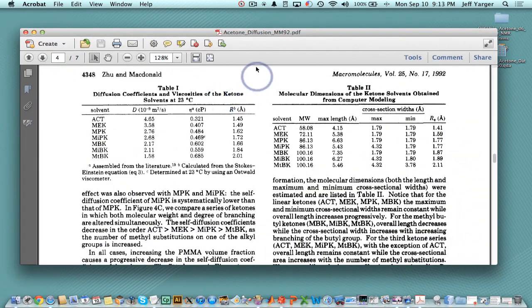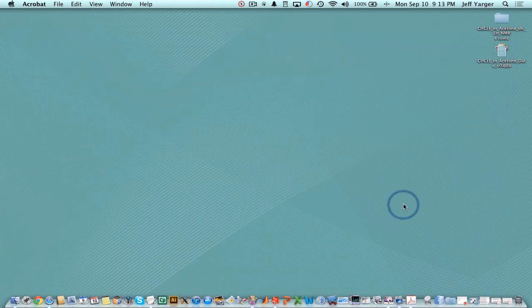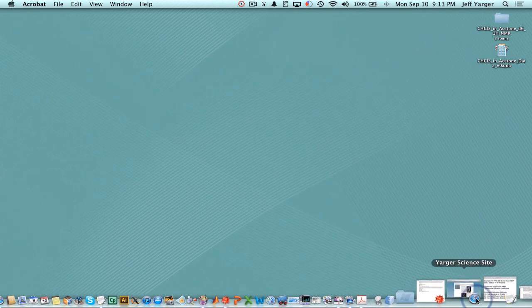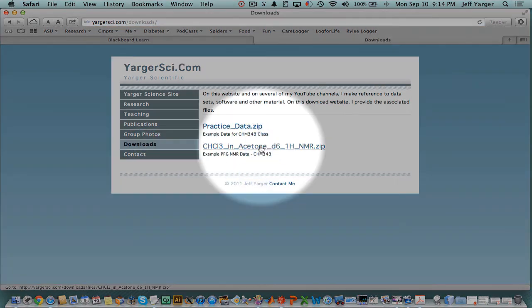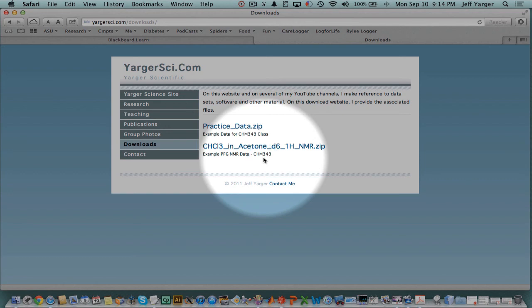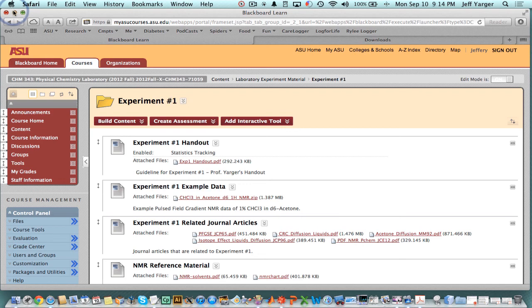A paper that gives the diffusion coefficient of acetone is a Macromolecules paper from 1992, which gives the acetone diffusion coefficient as 4.65 times 10 to the minus 9 meters squared per second — that's what we're going to use as our internal standard to calibrate. We're neglecting the isotope effect, which for this molecule is very small. You can get the data off yargorsci.com under Downloads. If you're in ASU Chemistry 343 PChem Lab, you can also go to the Blackboard site to get that data as well as several other papers and references.